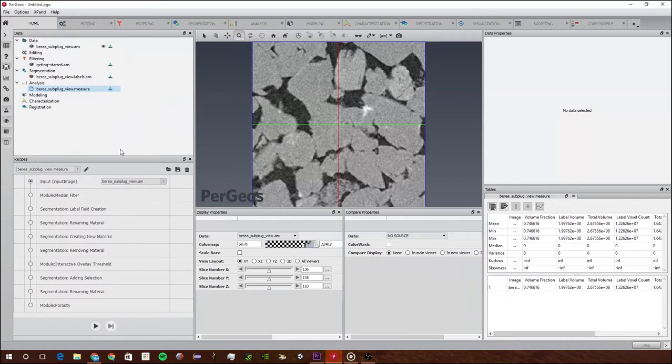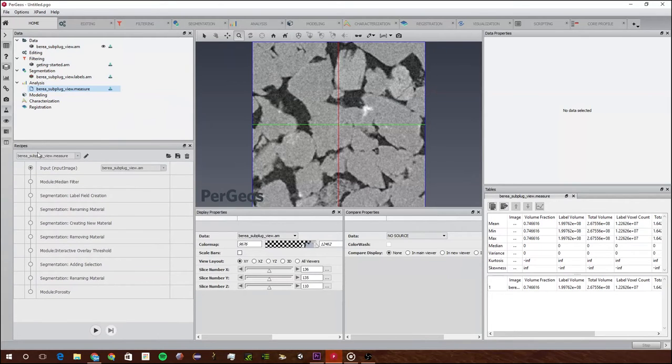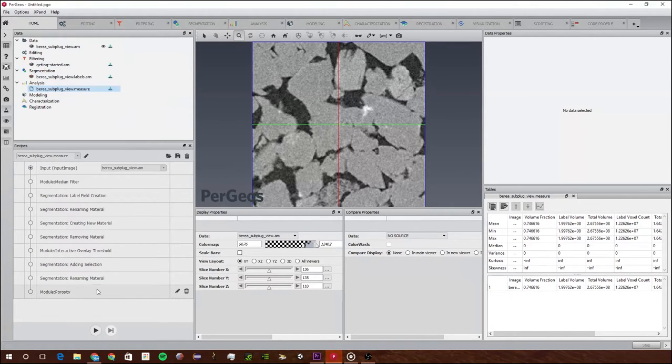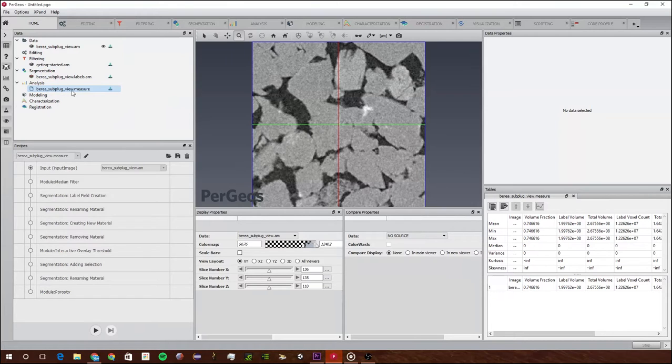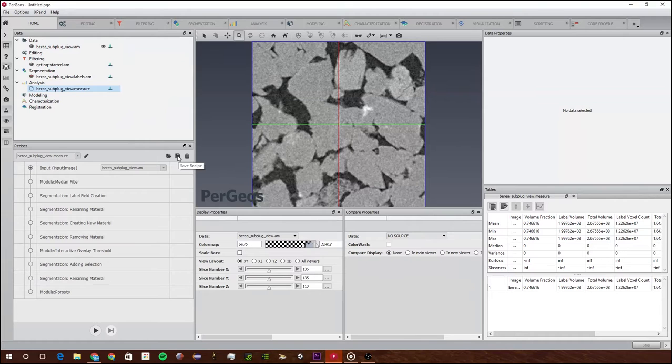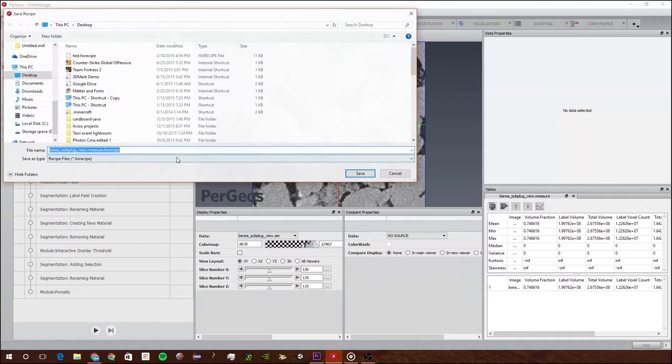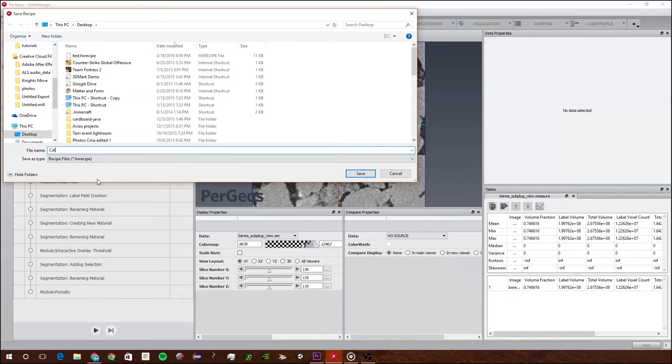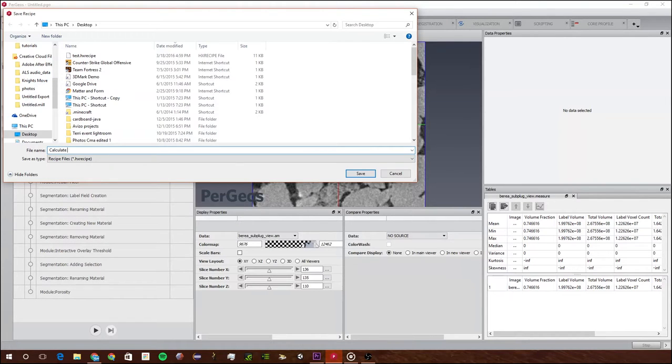As you see, this little panel appears right here and it shows us all the different parts that we did to get to the Berea subplug view.measure. The first thing I recommend you do is save the recipe. I'm just going to save it on my desktop and call it Calculate Porosity.